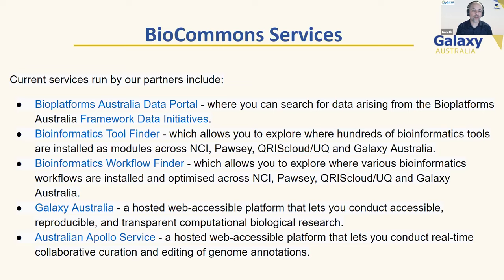The majority of the time I'm going to talk about Galaxy Australia, which is our web accessible platform that allows you to access those tools to conduct your reproducible and transparent research. And the final tool, which again I'll show in screen grabs, is the Apollo service. This is a web accessible platform to allow genome annotation in a collaborative manner, and a really wonderful service. So all these are accessible to Australian researchers.